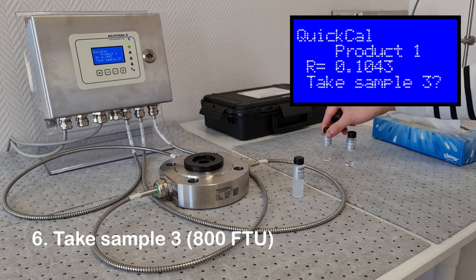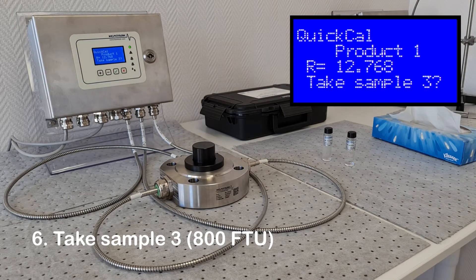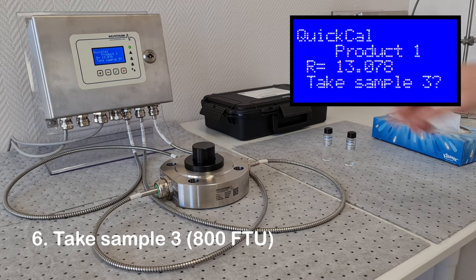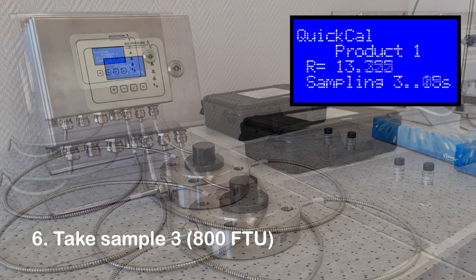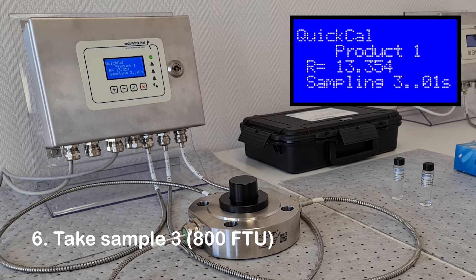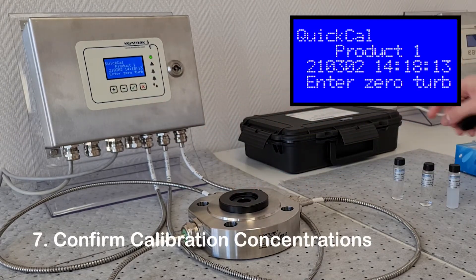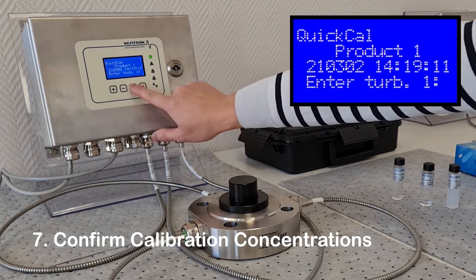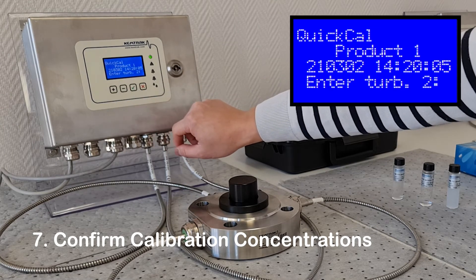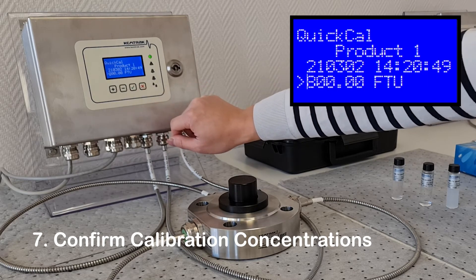The final standard will be 800 FTU. The analyzer will now ask for the calibration standard concentrations to be confirmed. In this case they will be 0, 20, 100, and 800 FTU.